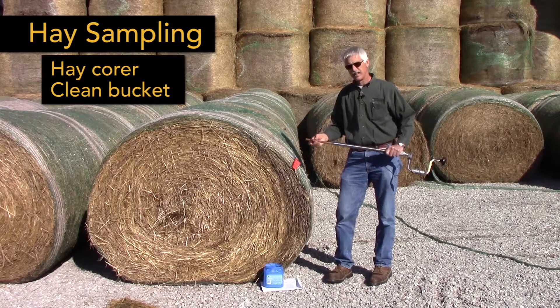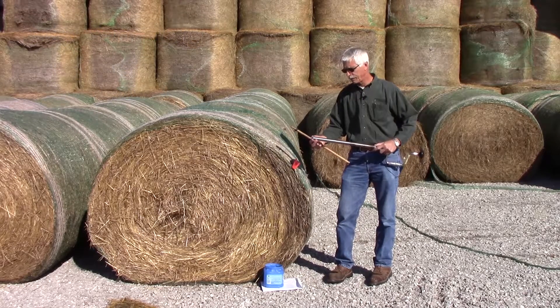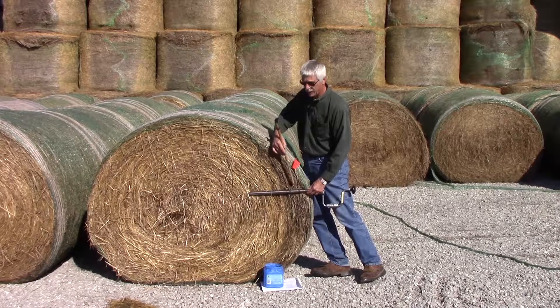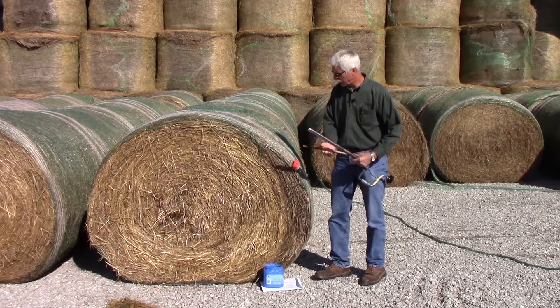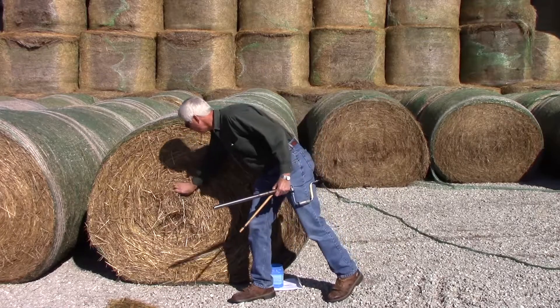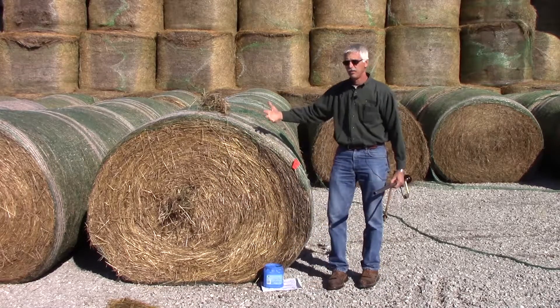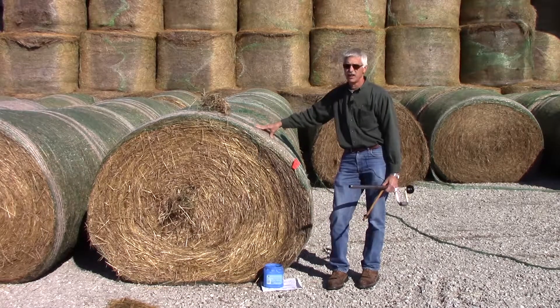Now we'll discuss how to take the sample. There are various types of hay sampling equipment. Most of them are a stainless steel tube with some serrated teeth. The idea is that we want to cut a cross section of the bale so we get a representative sample of what's going on. If we reach in and try to pull a grab sample, one of the things that can happen is we lose a lot of leaves, so our quality may not be representative — unlike taking a proper cross section of the bale.